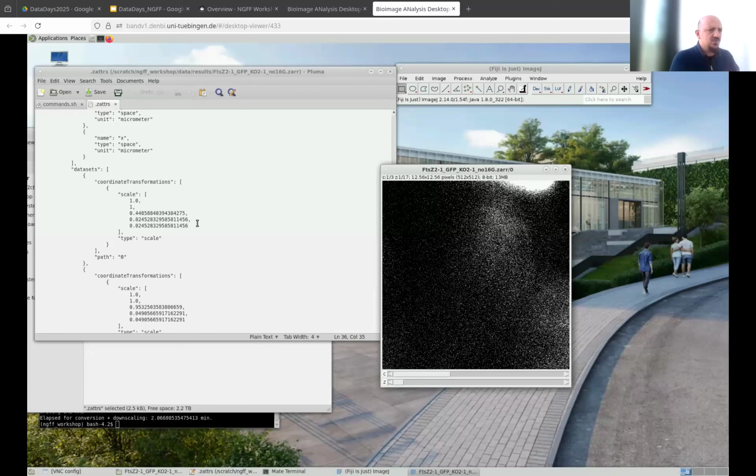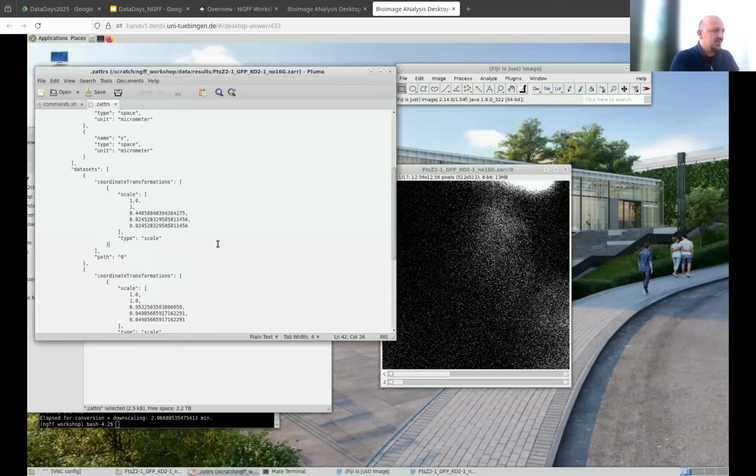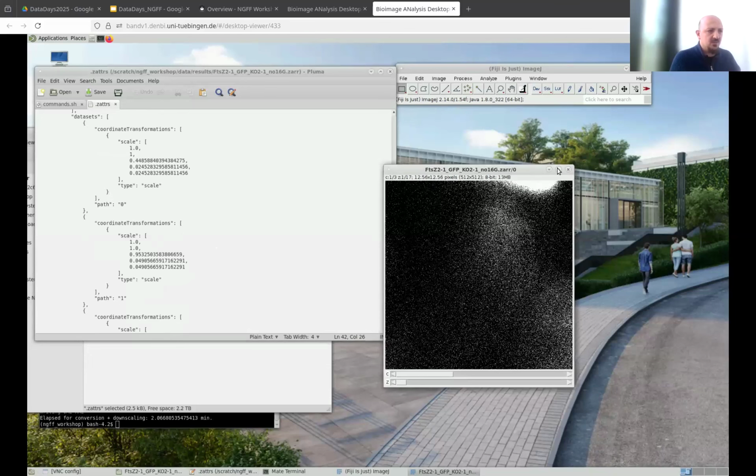This is especially true with visualization metadata, but even sometimes with pixel metadata. For instance, some tools require certain naming of the units or certain representation of the pixel sizes. So it is quite important to always double check when you are using any tool.